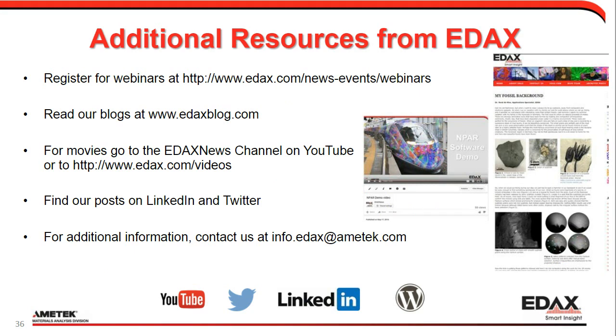And I see we already have quite a few questions in here. One of them we have here is, should you just run sputter-coated samples for EDS analysis? It's quite a good question, and it really depends on what you're trying to do. If you want to do true, precise quantification, no.